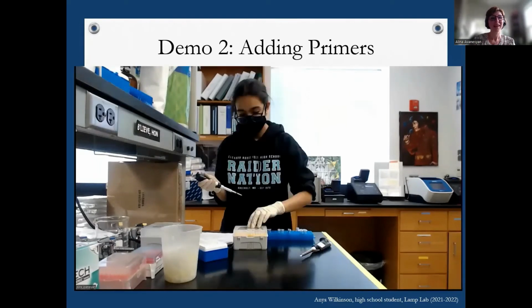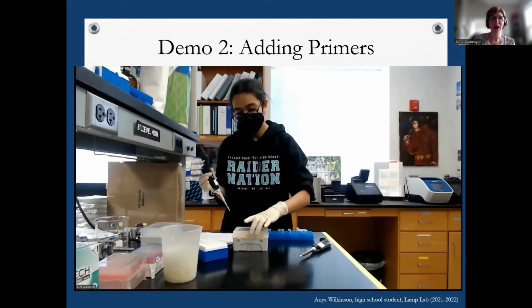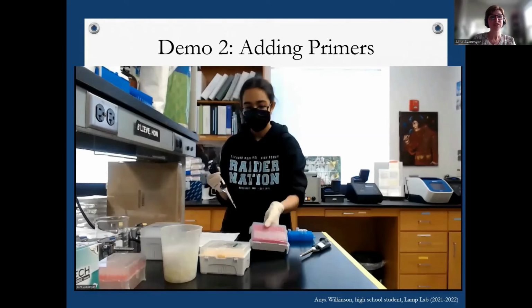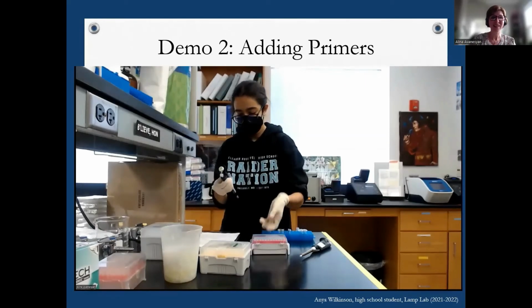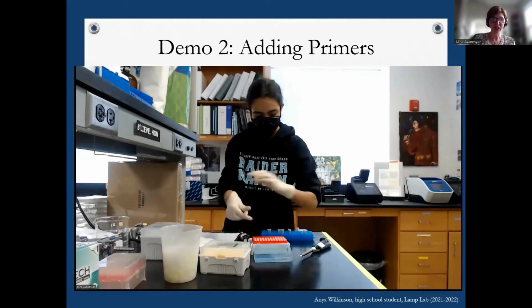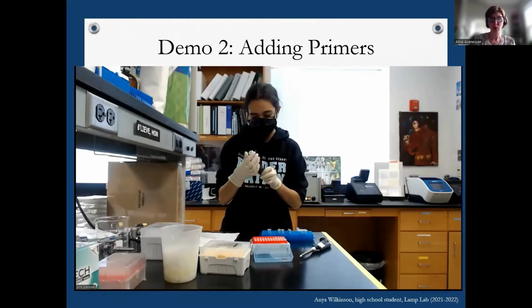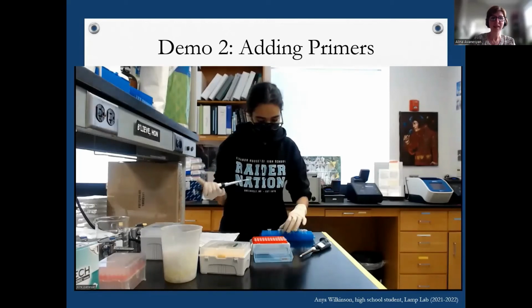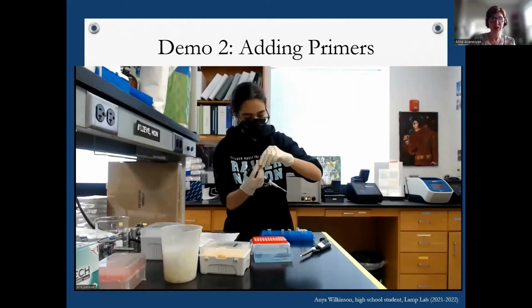Okay. Next, you can see how Anya is adding the primers. Since here we use very small amounts, the primers should be carefully added directly in the mixture. And the order of the primers doesn't matter. At the end, again, you need to vortex the tube very well.